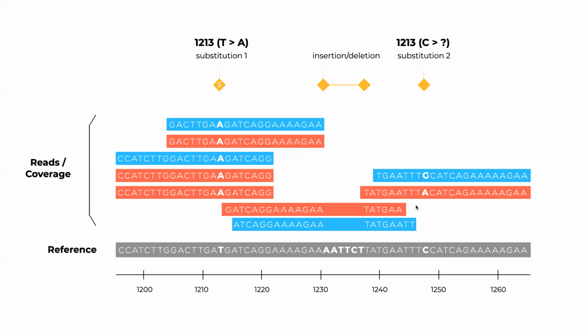But what if we have only 2 reads? What's the problem with 2 reads? They can have conflicting evidence: one is saying this, another one is saying this. There's no third one to really break the controversy, right? So we need at least one other one to know which variant here is the actual substitution. In other cases, you'll see insertions and deletions. What kind of evidence is needed to identify an insertion and deletion? At least a couple of reads that show you that both of them have a continuous sequence, based on what we see here, right?